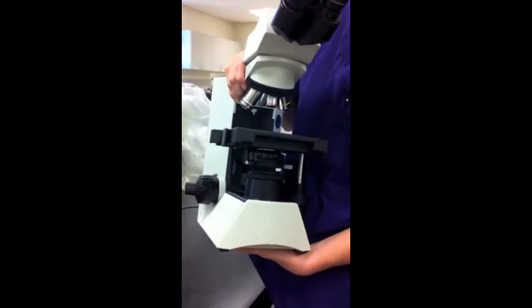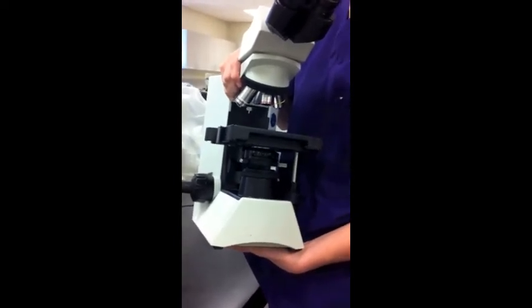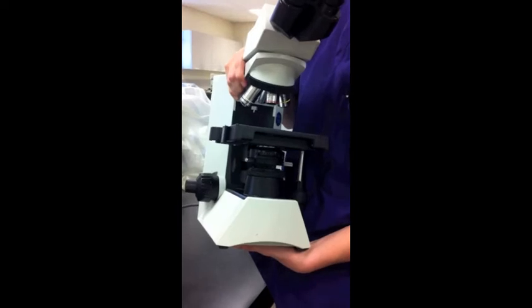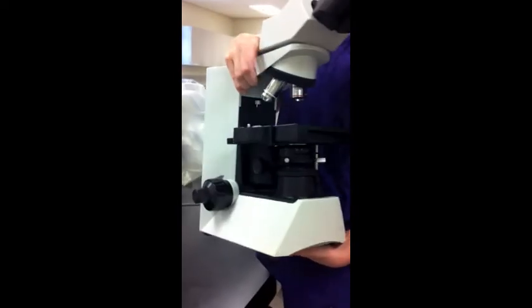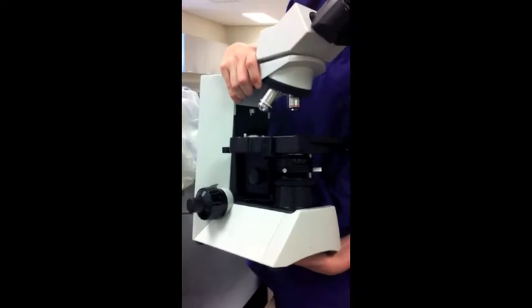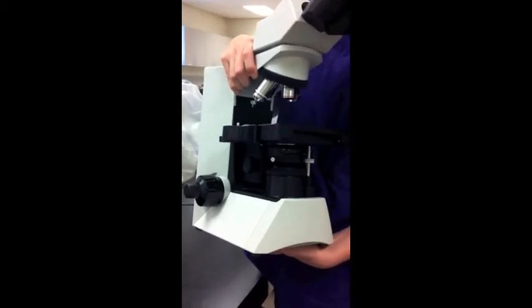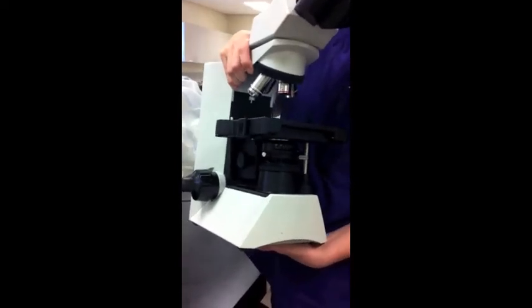The proper way to hold and transport a light microscope is to place your hand on the arm, which is the back, and support with another hand on the bottom, the base.